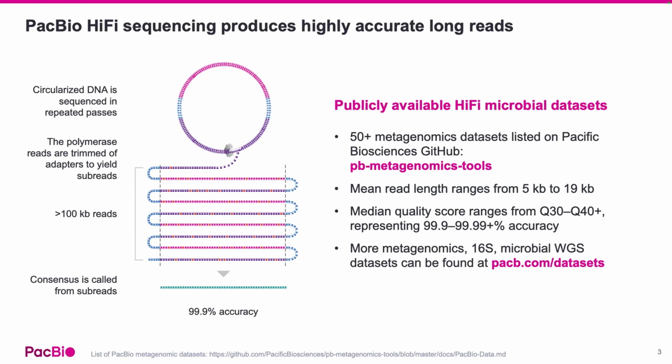This washes out any random errors, which are shown as these little red dots in this graph, and allows for a highly accurate consensus sequence to be called from those subreads. This results in what we call a HiFi read, that is typically an average of 99.9% or greater accuracy, or Q30. And the consensus sequence generation, so this HiFi read generation, actually happens on the instrument, so there's no need for additional compute off board for that HiFi read generation.